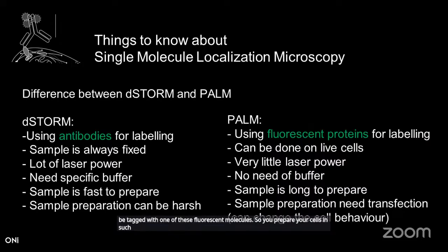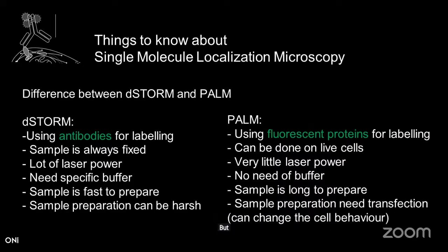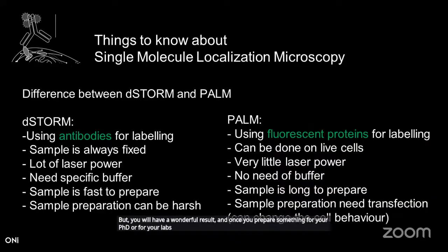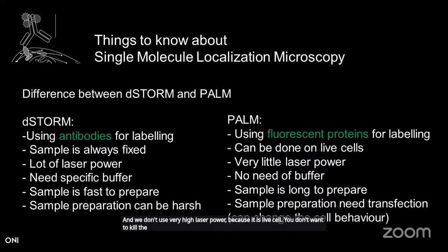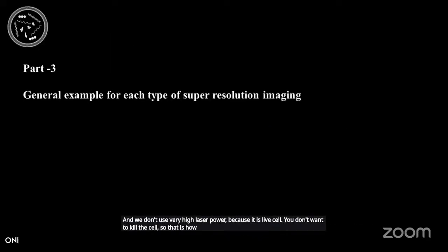It is a little lengthy process when you go for PALM as a technique, but you will have a wonderful result. And once you prepare something for your PhD or for your lab, that would be there forever. From there on, you can do the imaging at a much faster pace because you have created the model system. In case of PALM, we don't need buffers, and we don't use very high laser power because it is live cell. You don't want to kill the cell. So that is how it is taken care of.